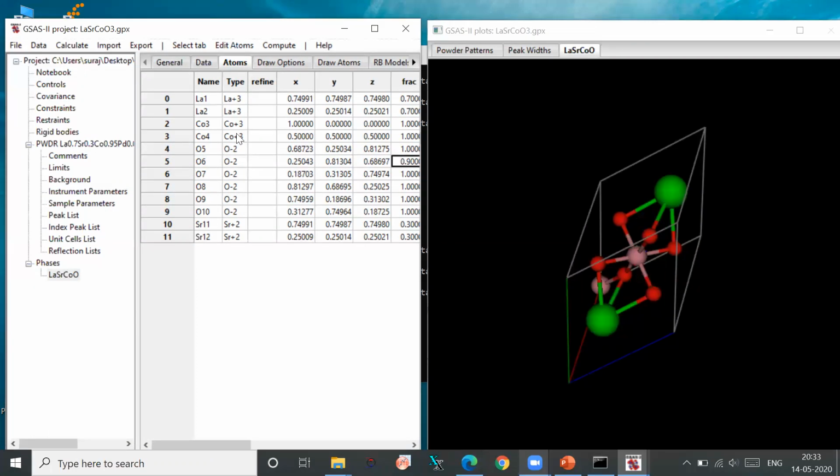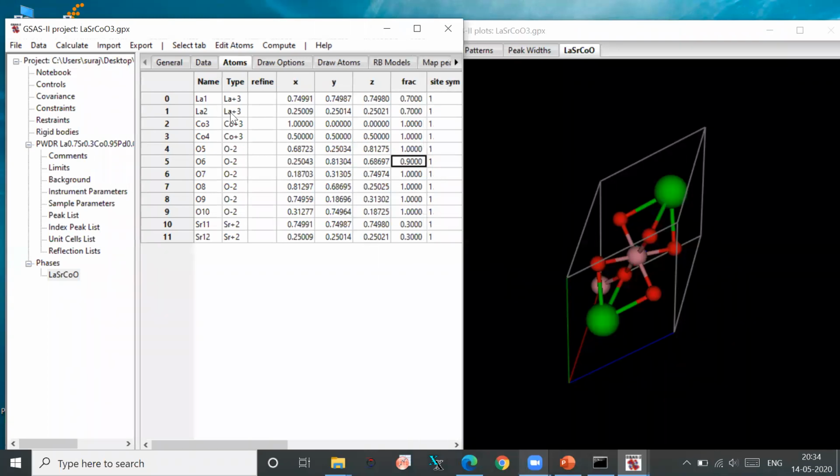So in this particular space group, which we have used in the standard pattern, there are these many different atoms per unit cell. This could be much simpler if you use another space group. I will show you that. Just for the sake of example, let me start with this composition. We don't know whether this is the perfect one. You have incorporated in one oxygen 10% vacancy.